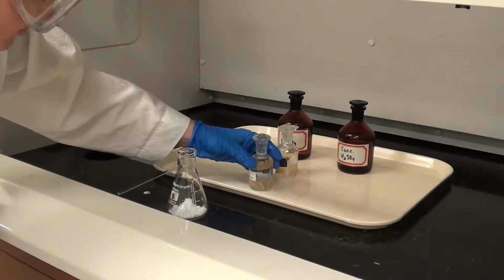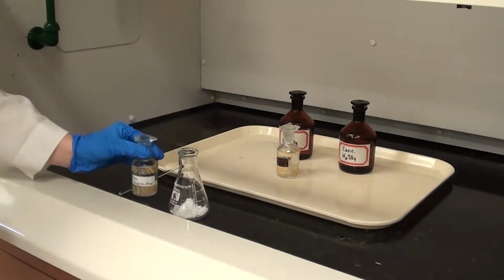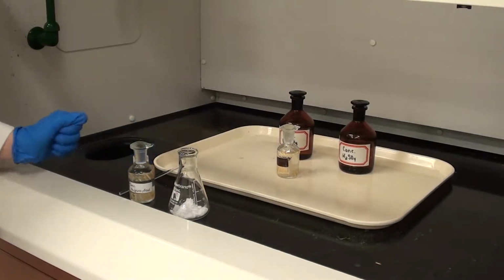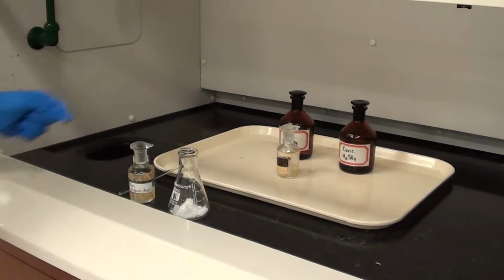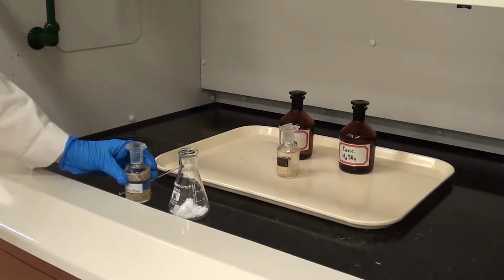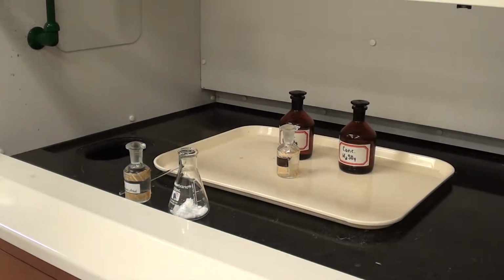So sulfuric acid here is in acid dropping bottles. We've used acid dropping bottles before, and you'll notice that there's a little nub at the top. Could you point to the nub? There we go. So that's going to have to be in line with the little channels that are on the side there. If you could point out the channel, yeah, there we go. So those need to be in line with each other.